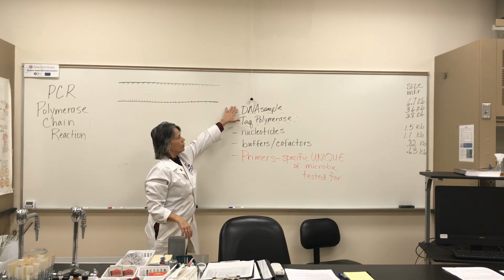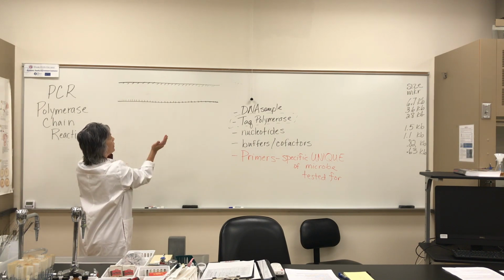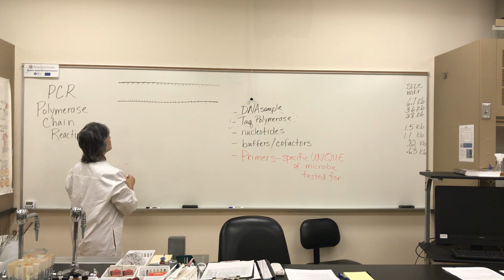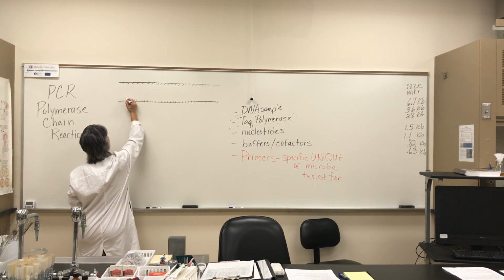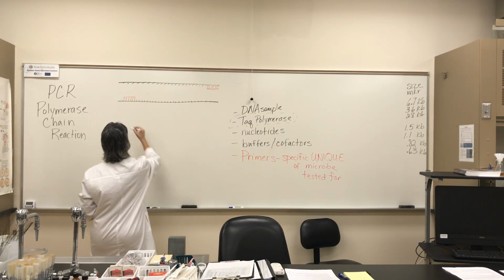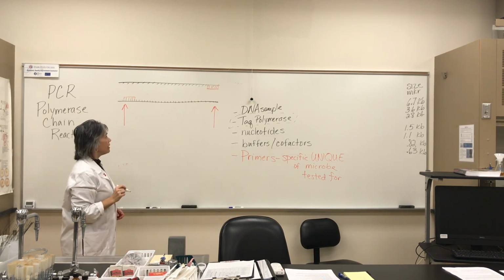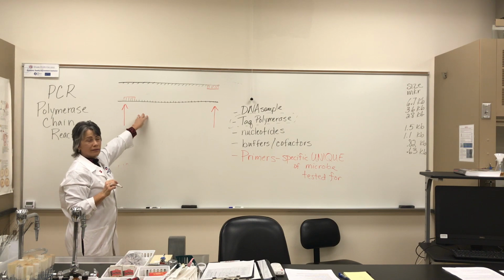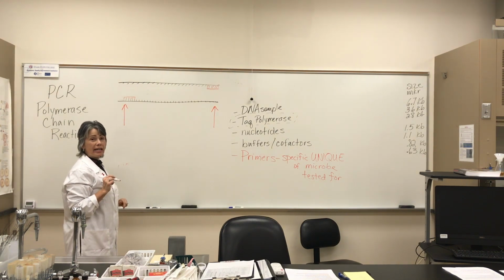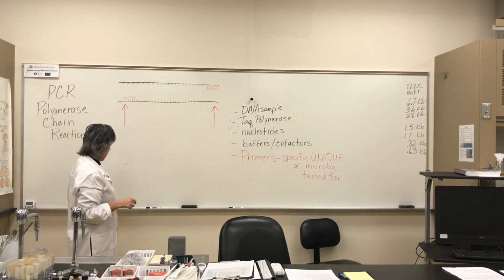So the DNA sample, also called template DNA, is that big gamesh of DNA, but we're testing for a very specific region that is specific to the microbe we're testing for. So let's put it in. That's good enough. So the magic is, if there's just a tiny little bit of this region in the DNA sample, if it's present, we can use PCR to find it, okay?